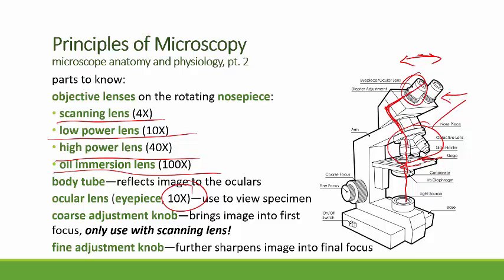They also screw out, and so they can do a little bit more focusing. So if you were just using your own microscope, you could actually adjust them to match the amount of magnification that you require at your own eyes, the correction that you need based on your eyeglass prescription. So everybody's eyes magnify and focus just a little bit different, and you could actually adjust those for yourself. I recommend that you just screw them all the way down and not try to mess around with them between you and your partner, because otherwise it's just too tricky.